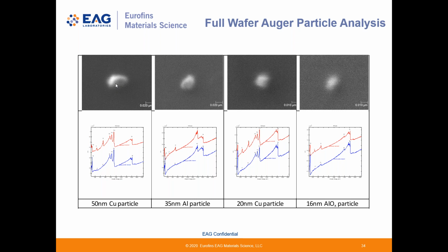Yeah, so we're almost to the end here. I think we have time for one more question. Here someone asked, is Auger sensitive to the oxidation states like XPS? It is somewhat.